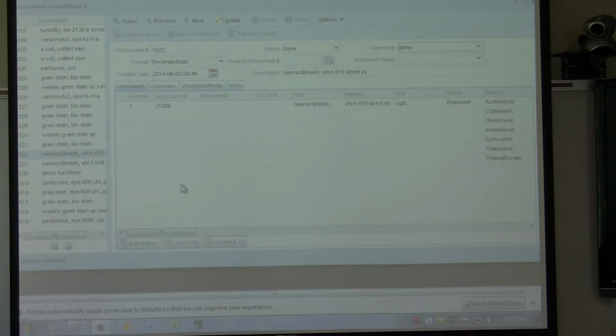Could we also go through one that has an Excel with formulas? You would obviously query, export, do your stuff in Excel, import, check everything, transfer results, and make sure they're checked. Some more key stuff here. I have to take a look at those buttons. So let's say export. Go do your thing, just like before, out to Excel.